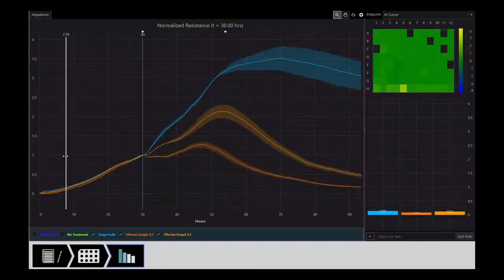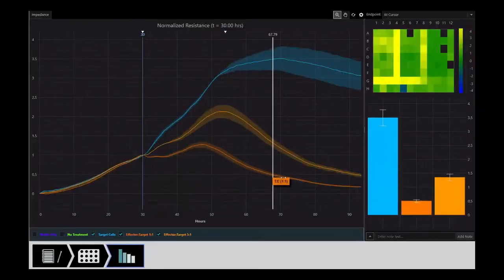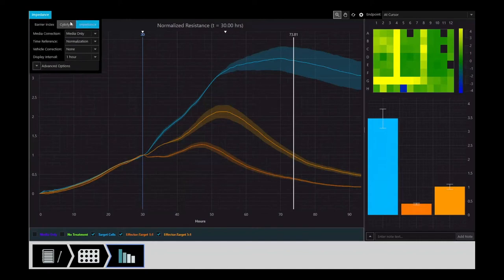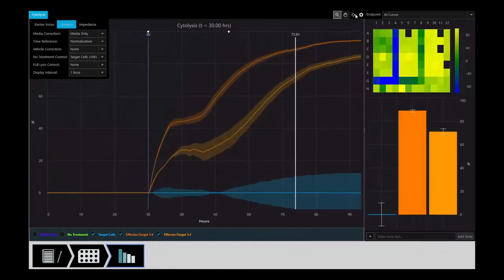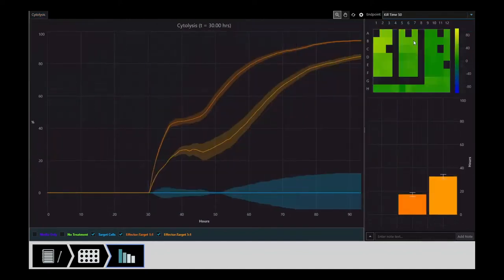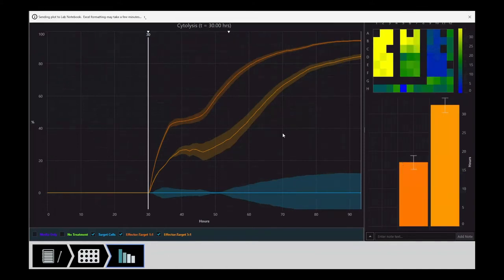Using sensitive microelectrodes embedded in the 96-well microplate, you can track changes in cell proliferation, morphology, attachment, and death before these changes are observable with microscopy. Now with compliance features, Maestro Z is ready for your next GXP assay.